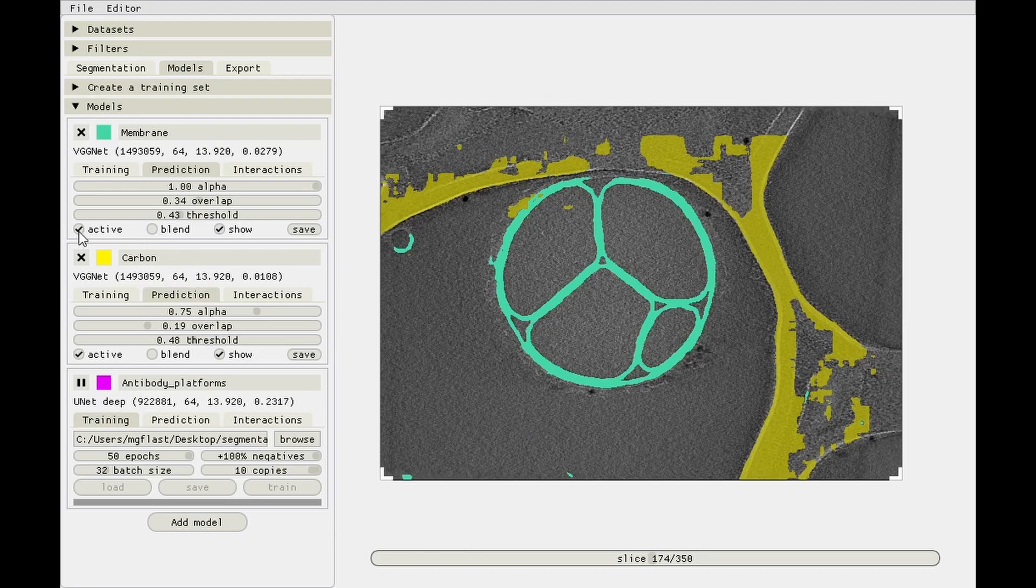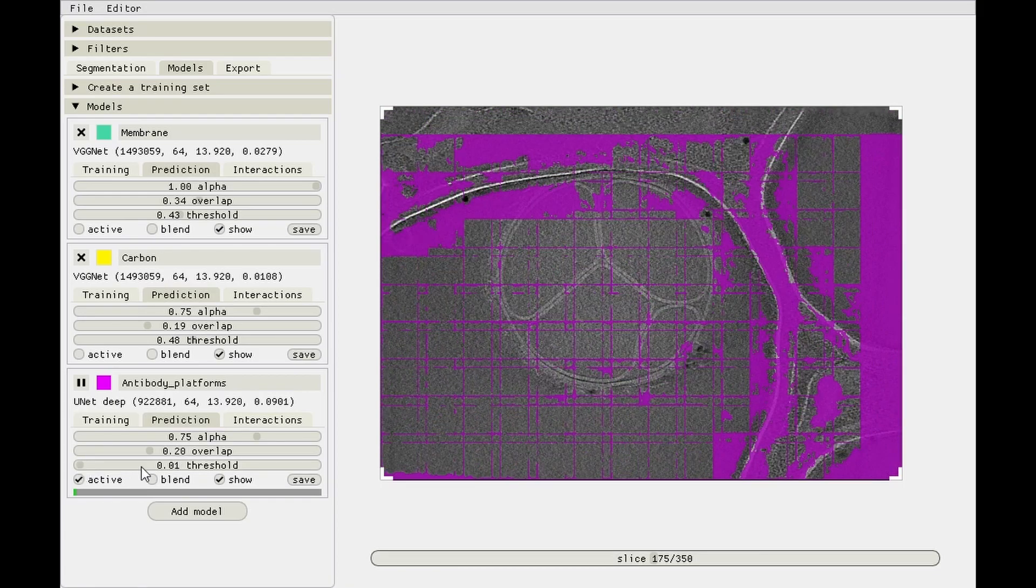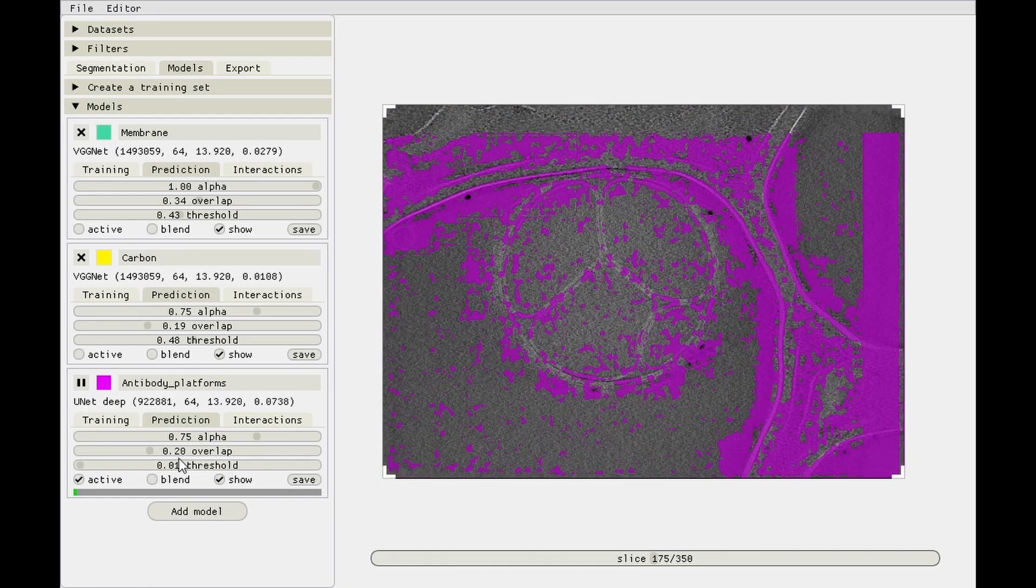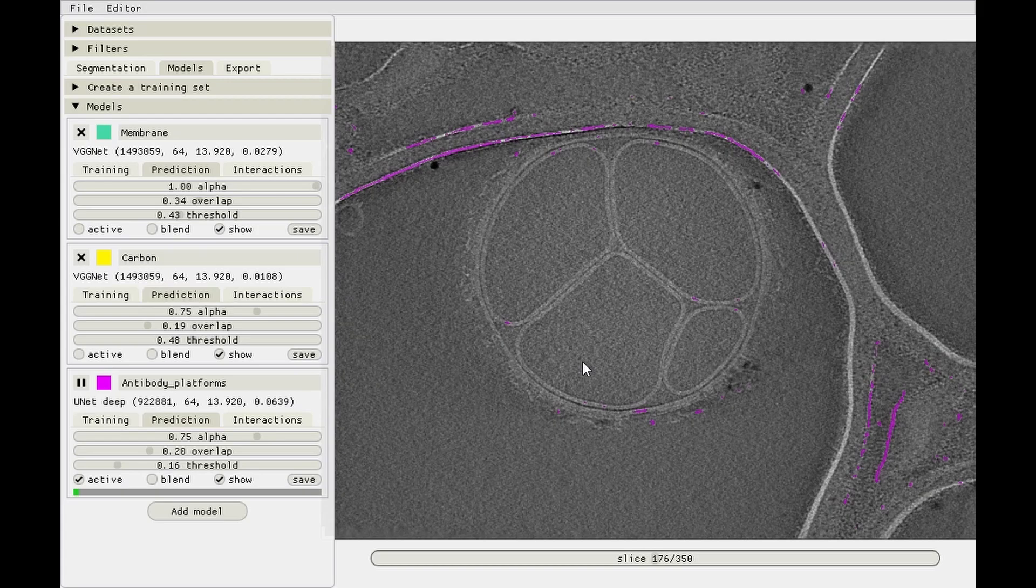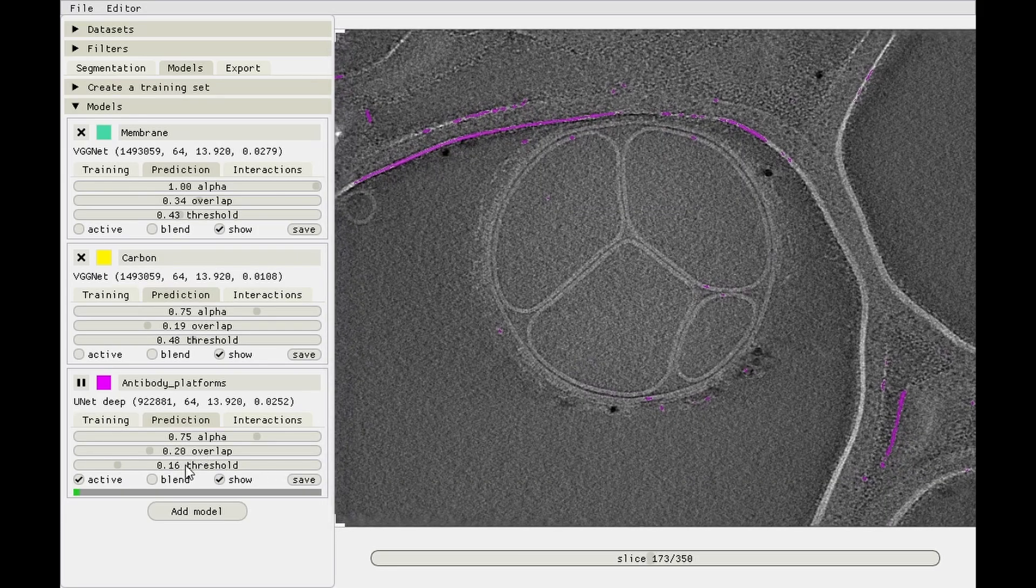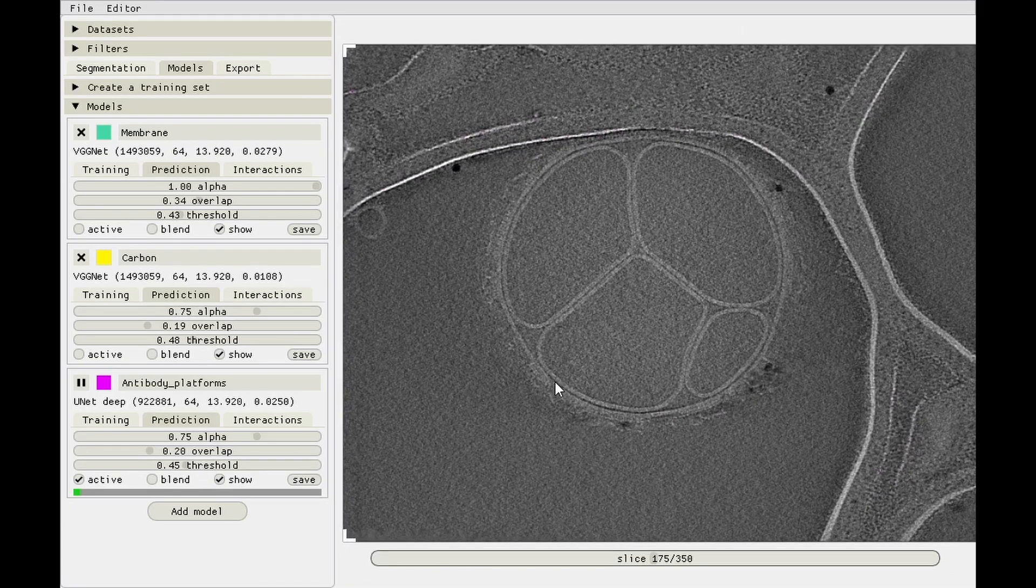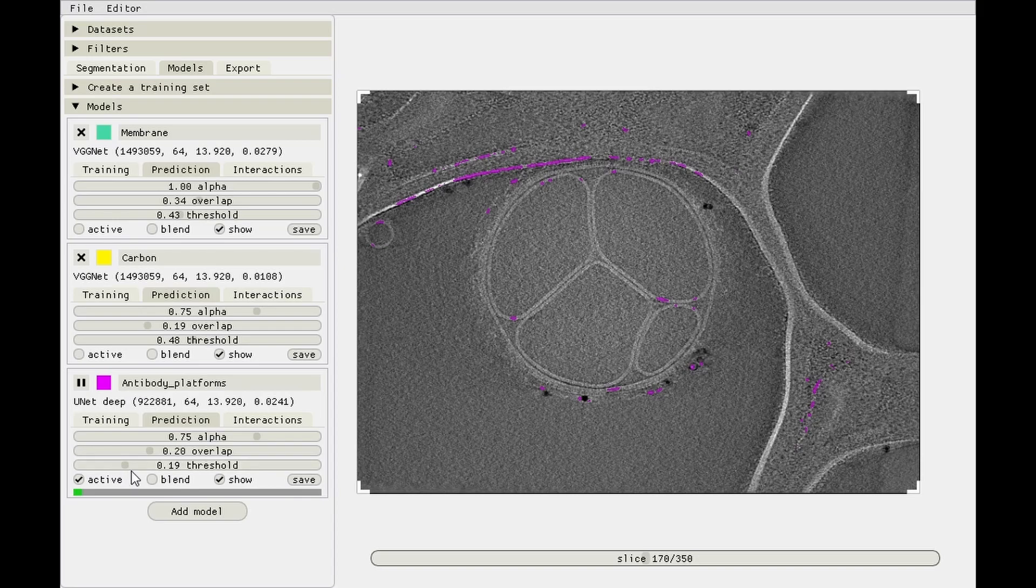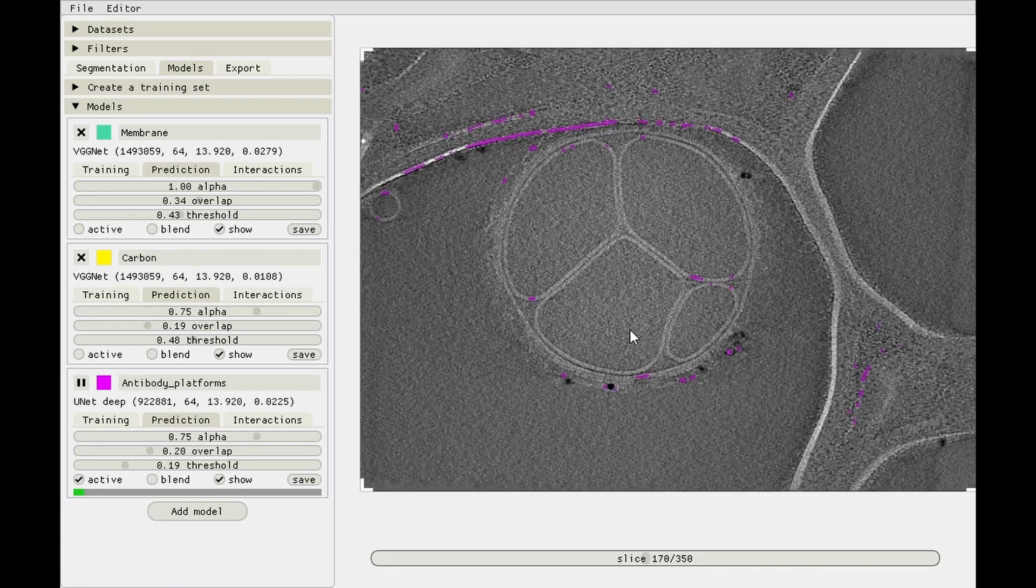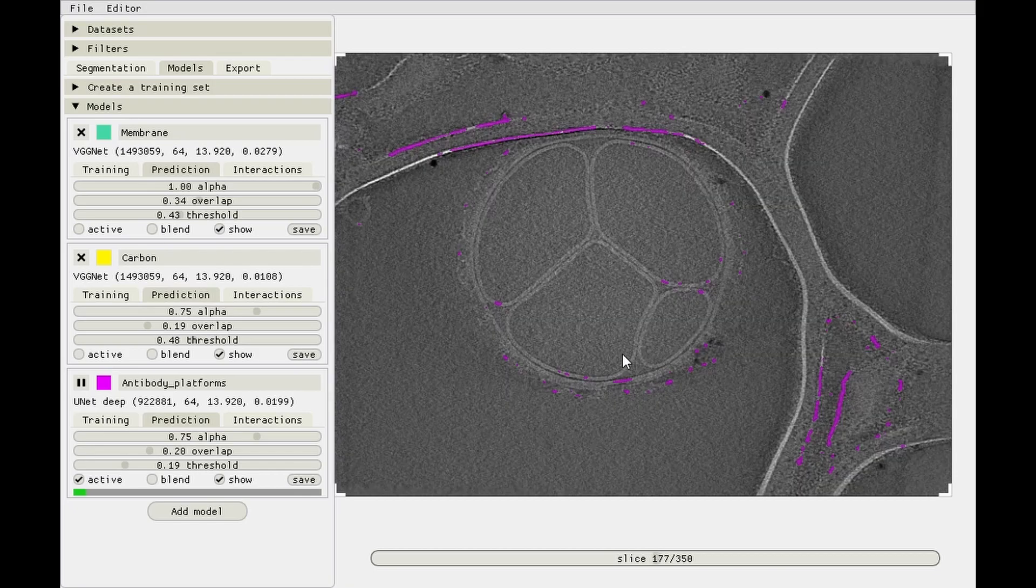And again let's turn off the membrane and carbon ones and see how the training progresses for the antibody platforms model. At the start, again not too well, but it's getting somewhere. Not great. But if I remember correctly we actually also saw that before, that the UNet Deep model misinterprets carbon edges as antibody platforms quite often. So in hindsight you should have used the other model, but we'll do that next time.